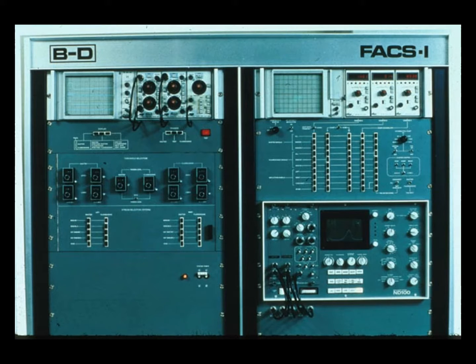We see now the first FACS that got made by BD after we had built a kind of a prototype here at Stanford, and gave the license for a FACS to be made for our lab and for John Wunderlich's lab at the Cancer Institute, with a contract from the Cancer Institute at that time.